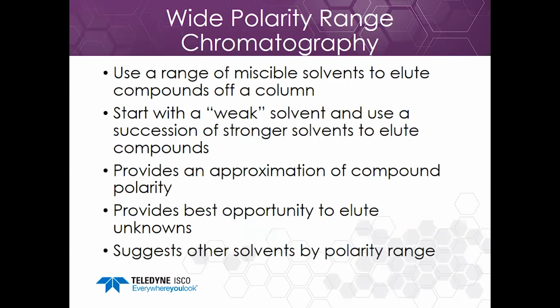It provides an approximation of the compound polarity. If I see where the active compound elutes, or where a family of active compounds elutes off of a column, that suggests a further purification strategy. Because I'm going to a very strong solvent at the end, it provides the best opportunity to elute unknown compounds, and it can suggest other solvents that might be useful.